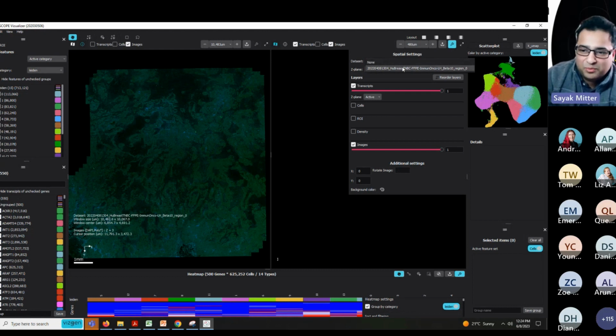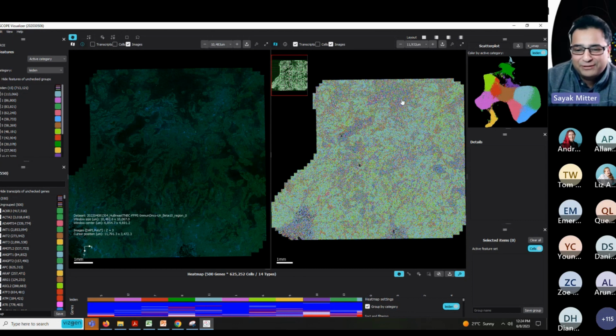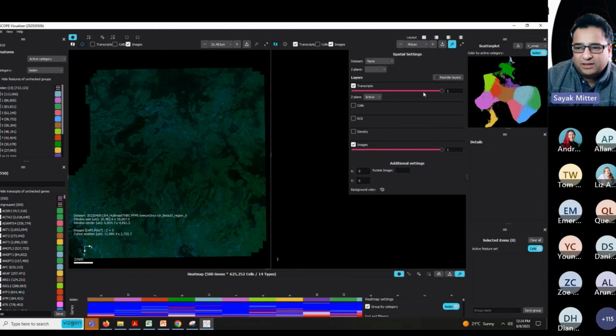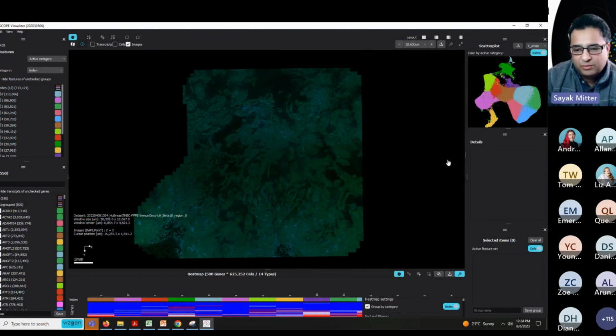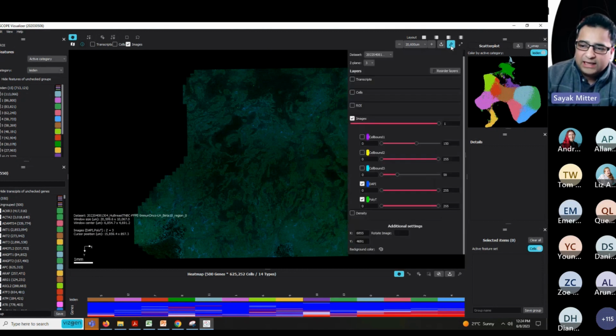Here, it's somewhat silly that I am going to use the same data set, but you can basically look at the same data set or different data sets side by side, whatever displays you choose. I think that really gives the user some convenience in visualizing their data, particularly when they're looking at donor versus control, etc. They are able to visualize things quickly.